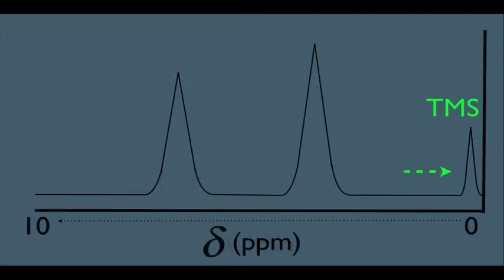Any peak that's, let's say, closer to TMS than others should have a similar environment. That is, they should be more shielded. Take this back to the principles too. Remember, a peak on the NMR gives us an idea of the energy necessary to bring a hydrogen into resonance. If your peak is near TMS, then the amount of energy needed to bring you into resonance is pretty close to the energy of the hydrogens in TMS. And remember, if the energies are similar, it also means your electronic environment is similar. So that's why the hydrogens in TMS act as a reference of the most shielded.